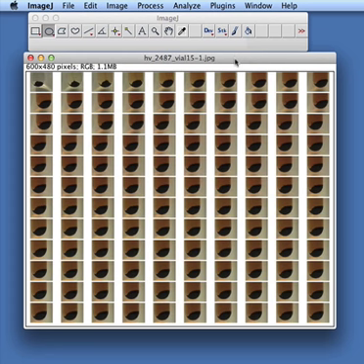Currently I have a color image. Now, a color image is complex. It contains red, green and blue information for every pixel that comprises the image, and I'm only interested in this case in the black material. The black material here is a coal particle that's been immersed in a solvent. You can't see the liquid, but you can see the solvent discolors, and over the period of, I believe, 2 days, what we've done is take an image periodically, let's say every 5 minutes, and you get the transformation from an original particle that's just had solvent added to a significantly swollen coal particle in the solvent.